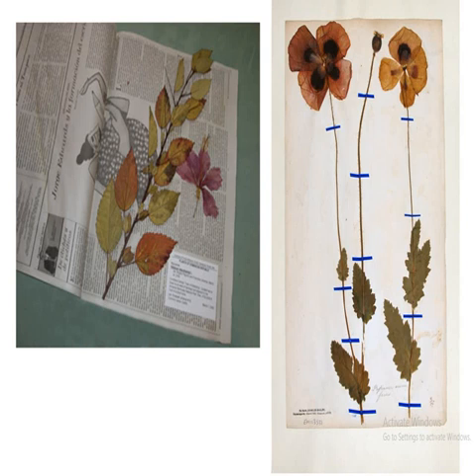So this is what you are talking about. This is your plant specimen. You see, we are having a leaf. This is the top part of the leaf. This is the underneath of the leaf. So some portions of the leaf should face up while others should face down, because if you don't turn the leaf at this particular point, once the plant is dry, if you try to turn it the leaf will break, and therefore you will not have a good specimen.